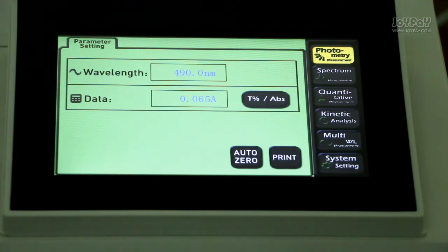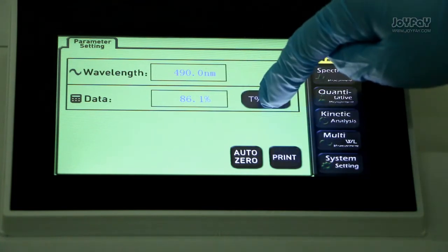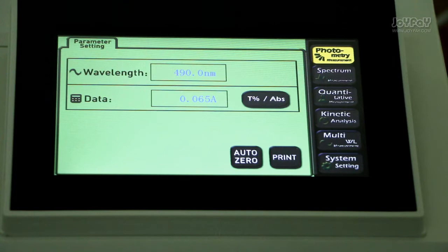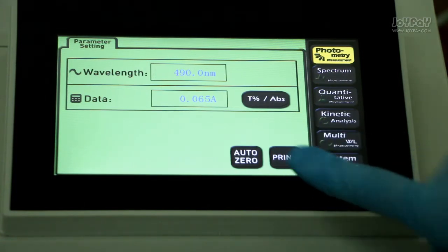By pressing T or ABS, you can exchange transmittance to absorbance. You can calculate the concentration of your energy. Press print button to print the result. Very easy for you to record the result.